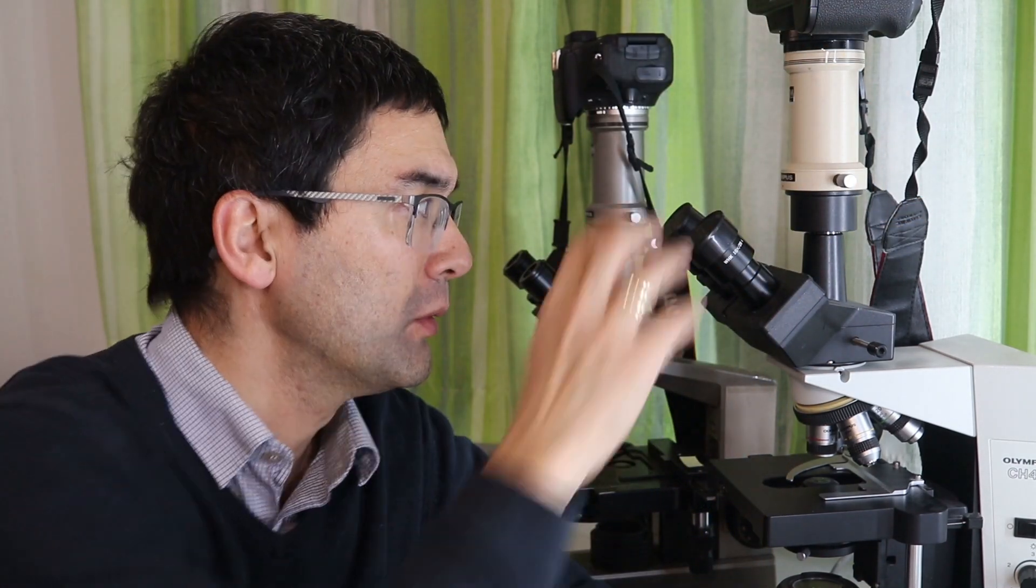So my advice is for right now until you gain a little bit more experience, stick to your microscope. It's good enough. It's perfectly fine. And then when you know a little bit more about microscopy and if you also know a little bit more about what you're going to do in the future and which direction you're going to go, then you can always invest a little bit more money into a better microscope. And then you can actually also think about maybe getting a microscope with a trinocular head that basically allows you to connect the camera and all of this or with two eyepieces and so on. So there are many more things.